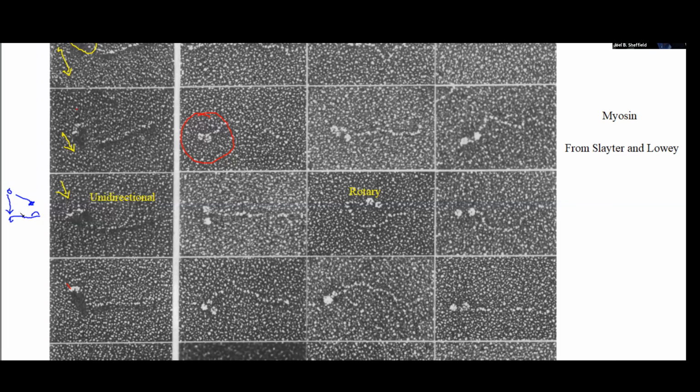The other thing that developed was the idea of saying, well, supposing I slowly rotate the sample as I apply the shadow. So the idea here would be I put this on a little table. The table sits on a motor in some way or other, and the motor makes this thing rotate.